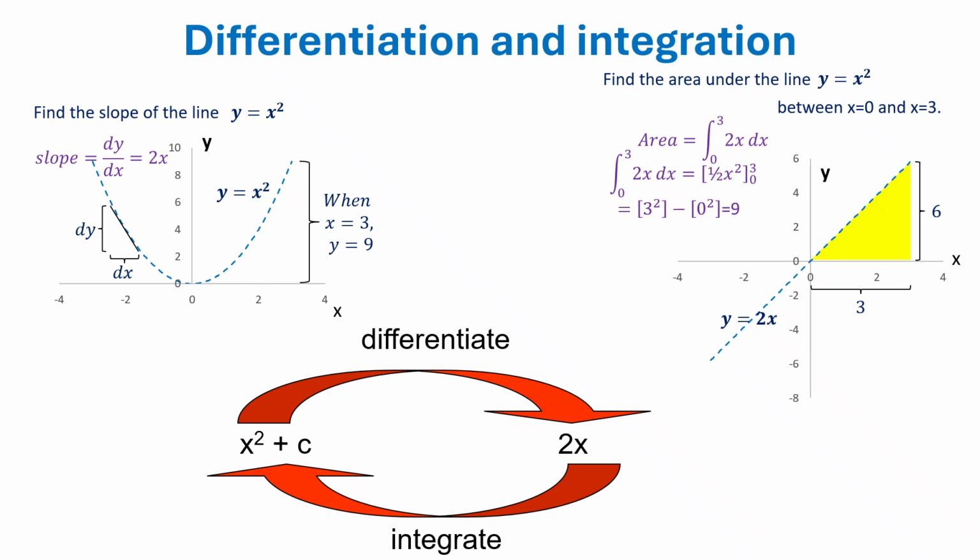Something that you should be aware of, don't get too worried by this, is that there is a relationship between shear stress and viscosity, and you could think of viscosity as being the differential of shear stress. Like I said, don't get too worried about that. Normally when we talk about anything that is going to be a differential value, we will state that.